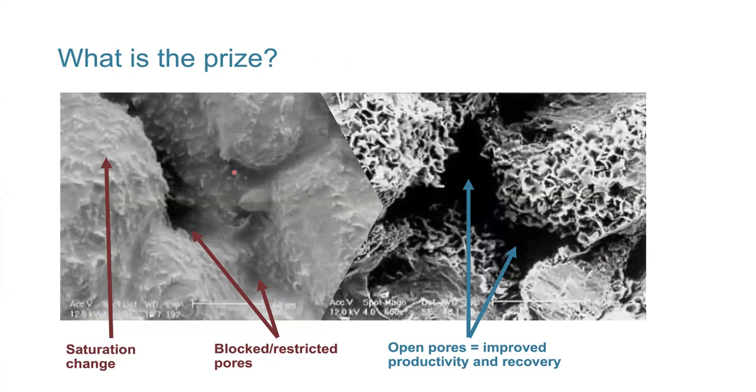We're right inside the pore network of the reservoir. And here, this black area is a pore. It's quite small. And here, this is a pore that's completely blocked. And what's blocking it is this smooth gray stuff that's sitting all over the grains, which is actually completion brine. So what happened here was completion brine was introduced to the formation so that we could examine the compatibility. Then we produced gas, remeasured permeability. It was more than 90% reduced in permeability.